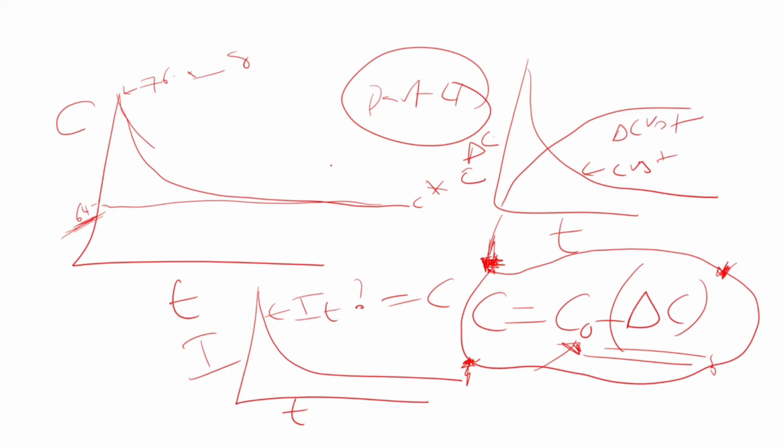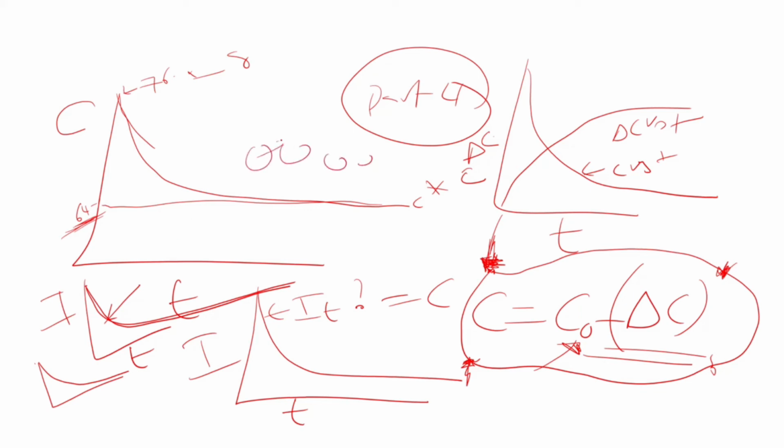I explained how you get intensity versus time, something like this. If the intensity is decreasing with respect to time, it means the concentration in the solution in the crystallizer is decreasing, and that's normal because your crystals are growing at the expense of supersaturation in your solution.